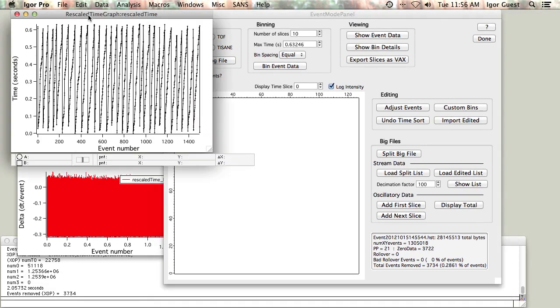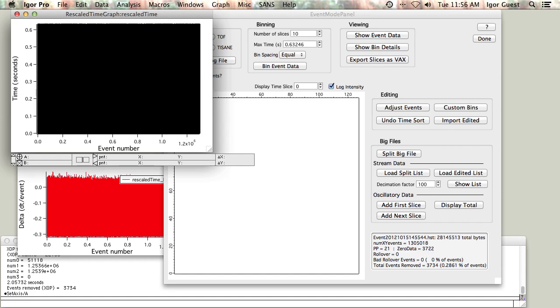So, given that this data looks good to me, if you wanted to see all of the data, this would take a bit of time. The way to do that is Control A, which essentially says select all, and this will show the entire data set. You'll get a little watch or spinning beach ball or hourglass as it takes the time to actually display these 1.3 million data points. Packs them all on there. It's not terribly instructive. There are other better ways of viewing this.